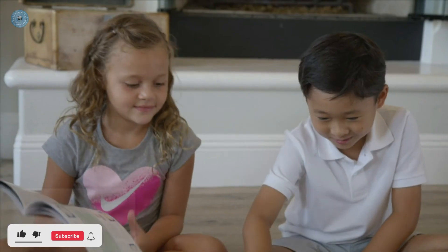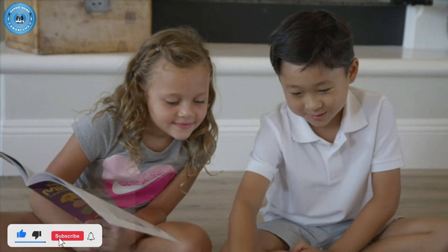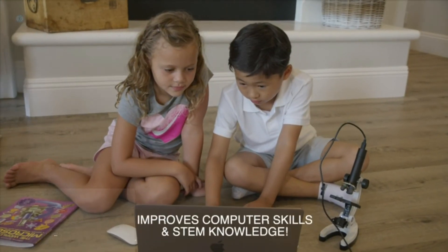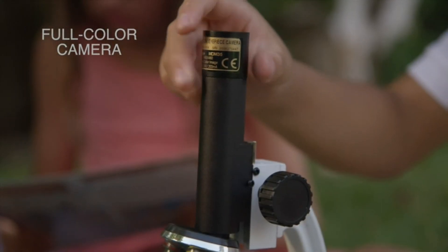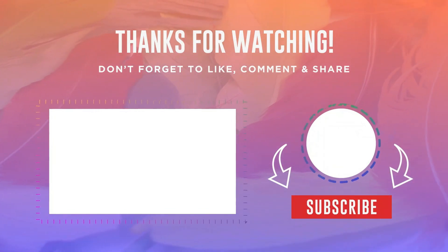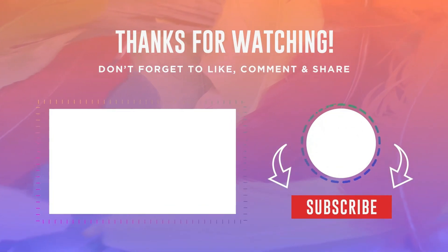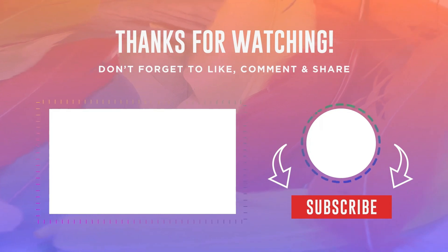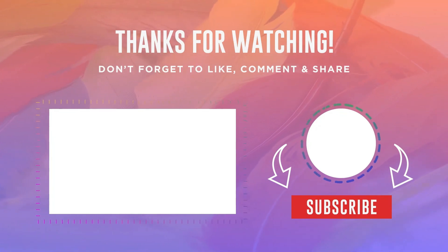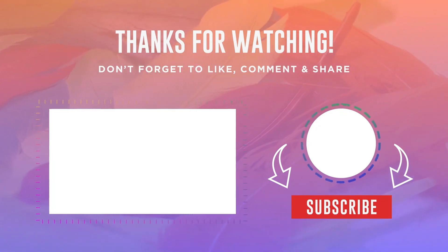New from Amscope: our premium 85-plus-piece microscope and color camera kit with exclusive kids-friendly software, blank and prepared slides, experiment ideas, tools, and other accessories — all in a rugged ABS plastic carrying case. The exclusive kids-friendly patent-pending software downloads easily, contains a microscope how-to section, sample specimen library, and an interactive real-time specimen image editing page. Thank you so much for visiting my Gadget Guide channel.